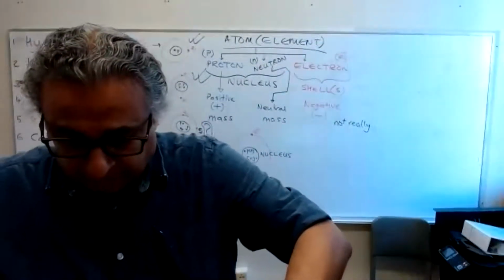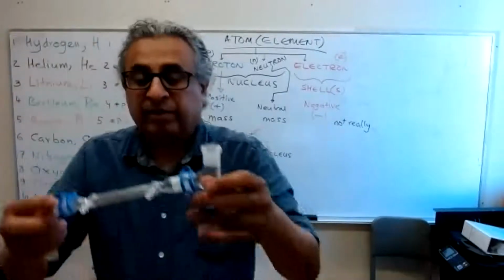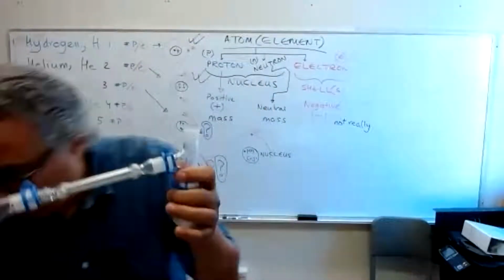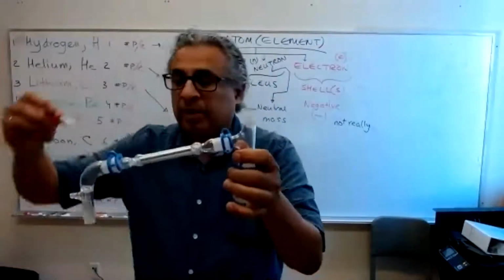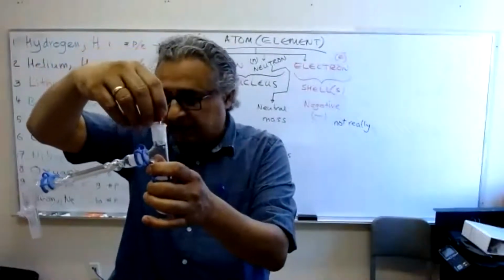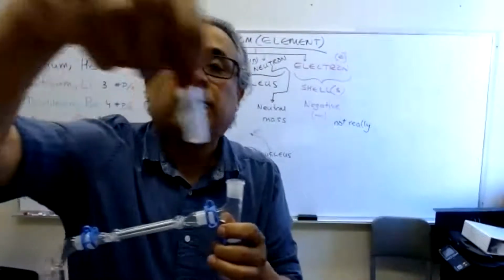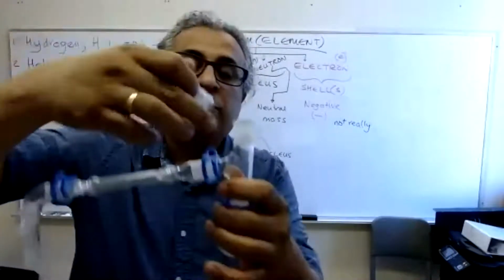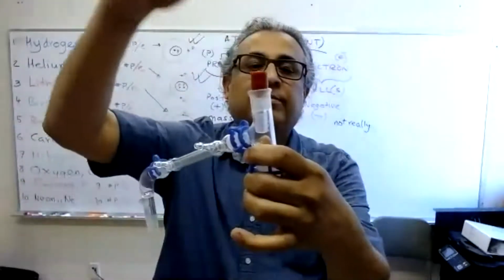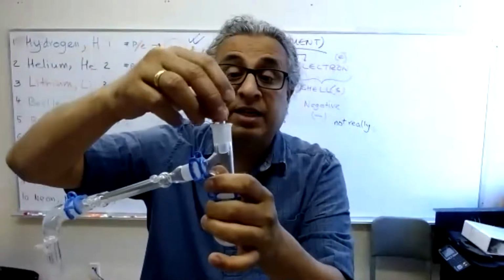Now I'm getting into the risky zone of doing something stupid and breaking and regretting. So now your setup is pretty much ready, okay? Only one thing that's missing is this is a wrong size. This is a 1420 joint. Unfortunately, that's a 1922 joint, okay? You should not be using it. This is a bad idea.